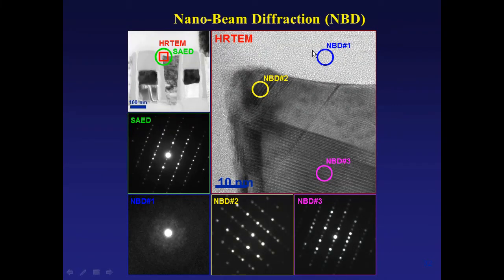In this selected amorphous area, electron diffraction makes a hollow pattern, meaning amorphous, no structure. At the yellow position here is the silicon single crystal, and the pink area is a different orientation of single crystal, like this. Okay, if the selected area is a much larger field of view, as green like this, all the information overlaps, but nano-beam diffraction can select a small limited area and the information can be clearly observed like this. Now for structure analysis, nano-beam diffraction is very effective.